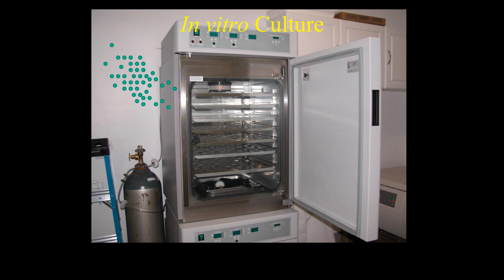In vitro culture is basically taking larvae from the females and putting them in petri dishes in an incubator with the right physiological conditions and allowing them to transform in the petri dish.